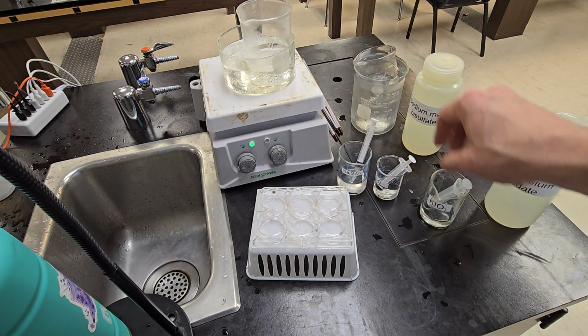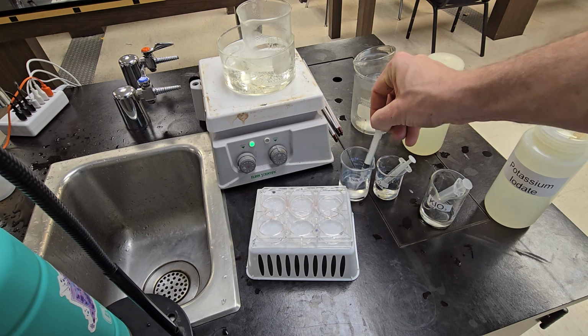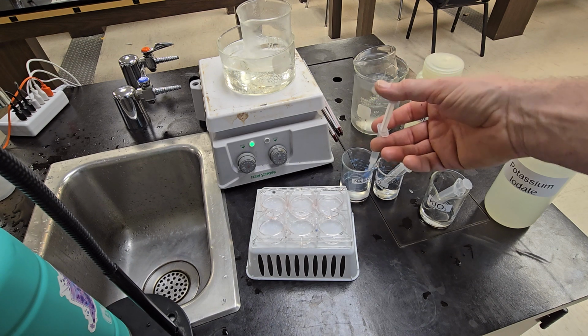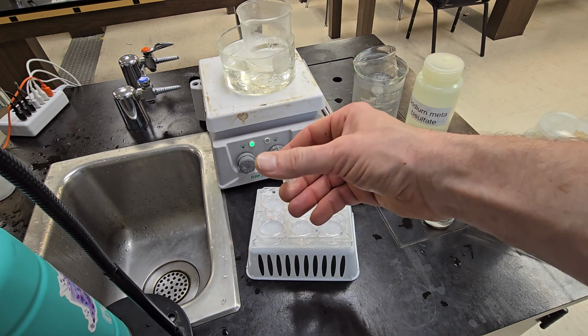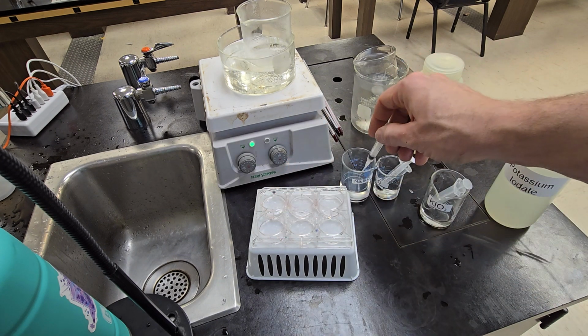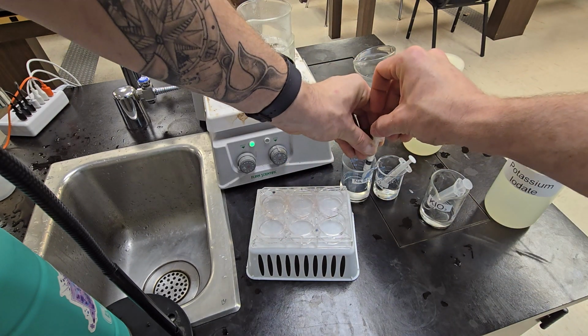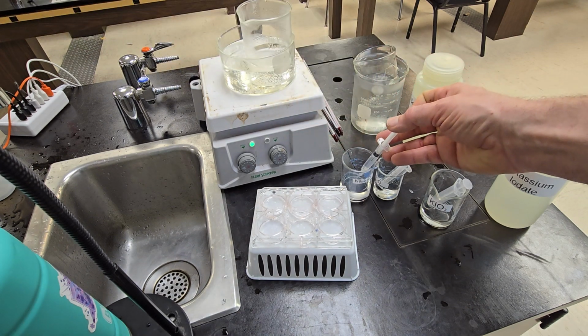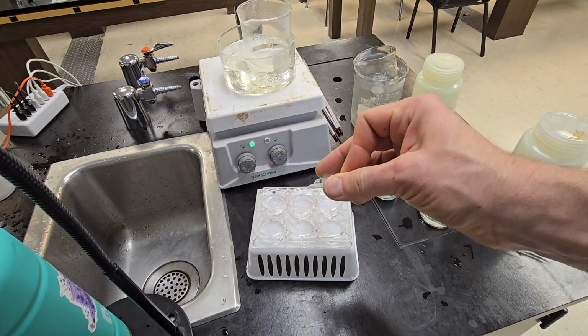I'm going to inoculate our 3 plates, each with 2 milliliters of sodium metabisulfate. Plate number 1. Plate number 2.